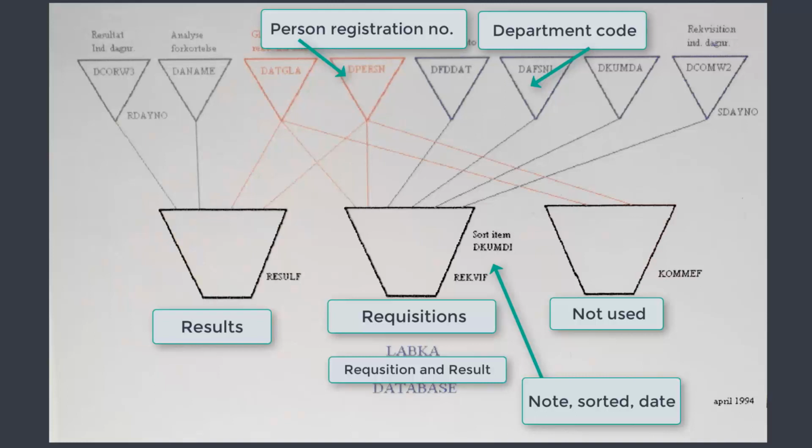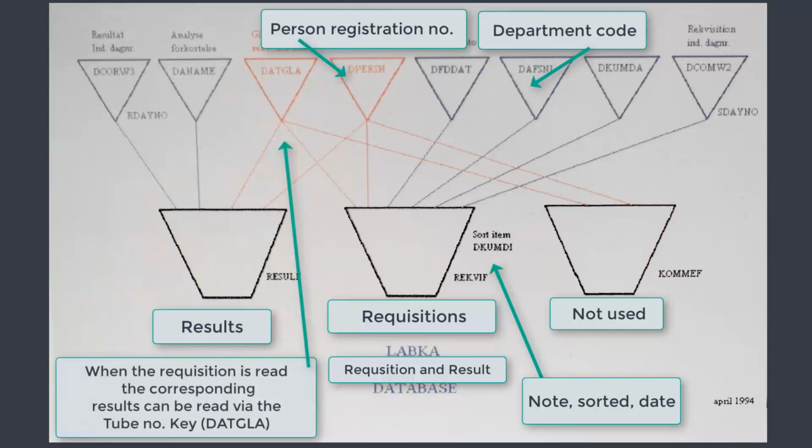Here the person registration number is used to obtain, via the hash index, the pointer to the patient requisition record. The relevant records are linked together in date order when created. This is a database feature. That is the order to be used for searching and cumulative printing. The read access can hardly be done faster in a large disk-based archive. However, a search in the work register is approximately twice as fast, which is due, as mentioned, to the result records being physically collected.